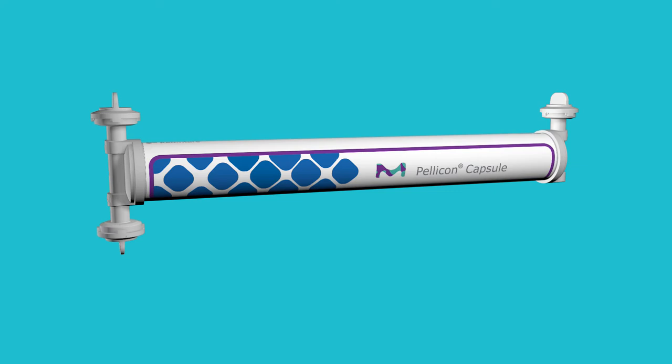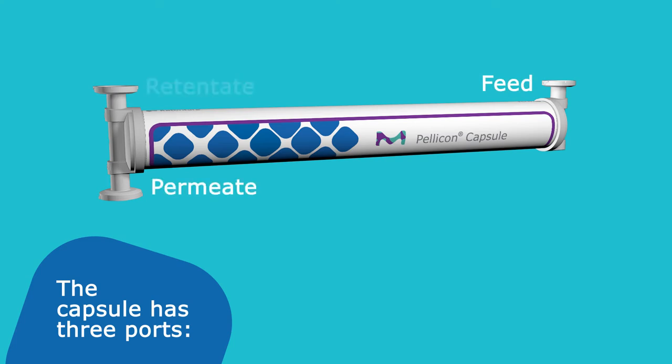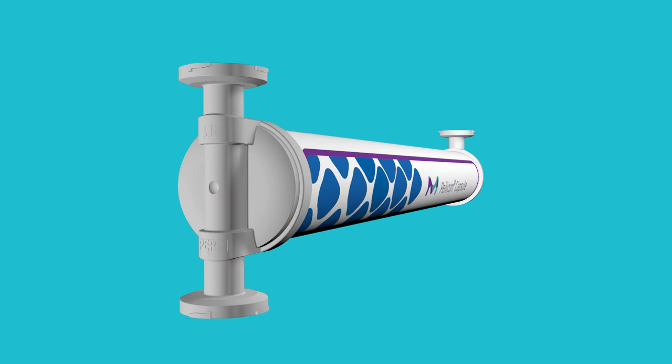When ready for use, the twist caps and O-rings can be removed. The Pelicon capsule contains three fractional sanitary flange connections — a feed, a retentate, and a permeate connection — each identified on the ports and capsule label to assist you with proper connection.